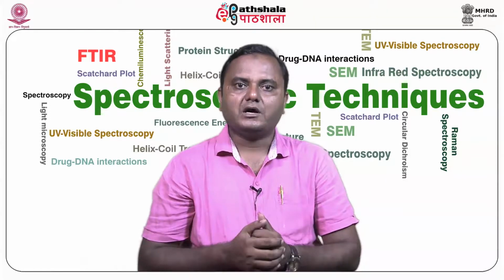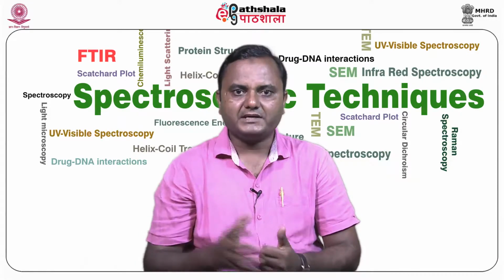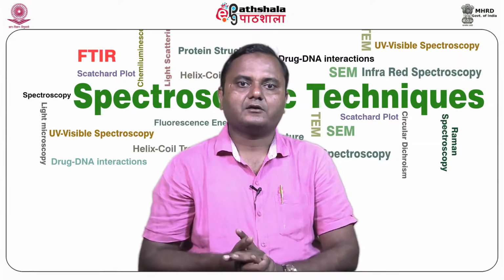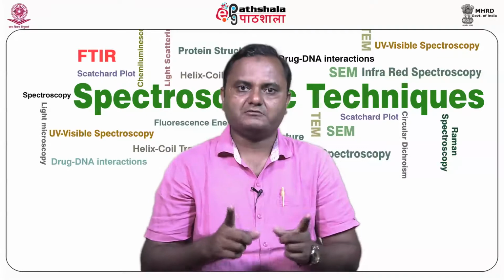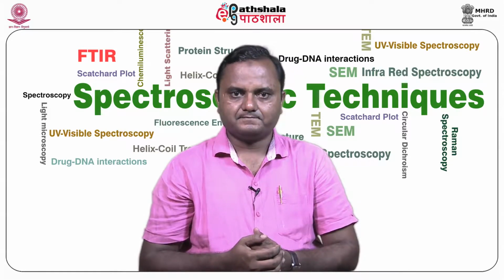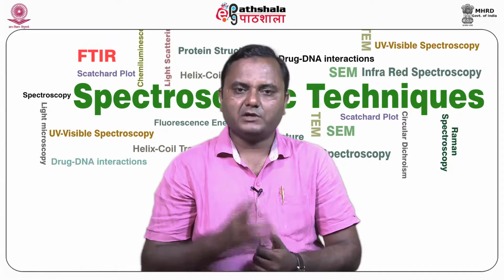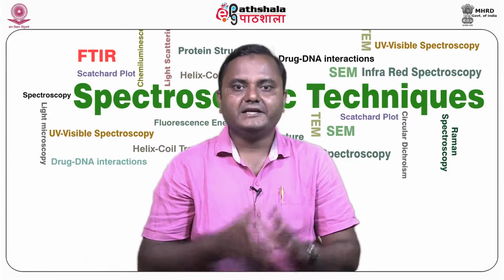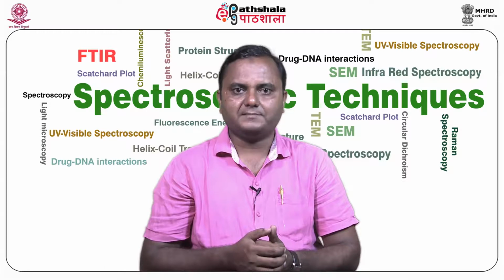It is difficult to know how to select the fit model. The design of the optics means MALS systems have larger flow cells, and the complexity of the optical design may introduce noise and reduce accuracy. So, the optical complexity increases the cost of the system. MALS offers a universal solution by measuring the molecular weight and Rg value for all different types of sample, but the nature of the design forces some compromises on the measurements.